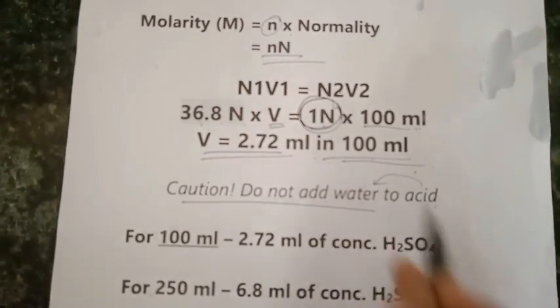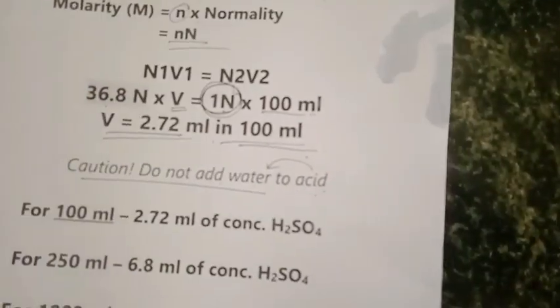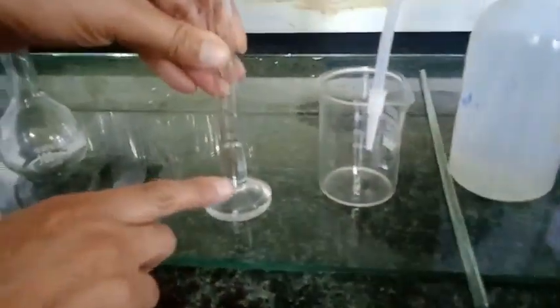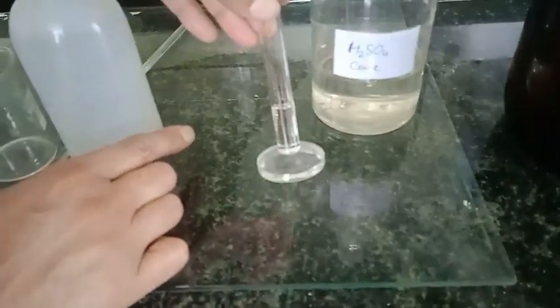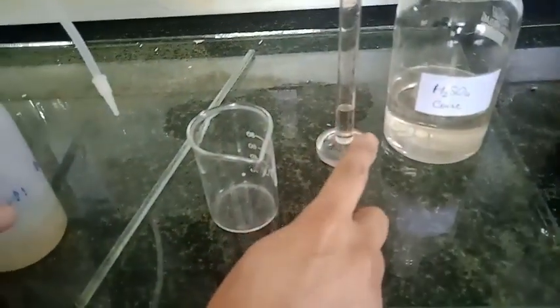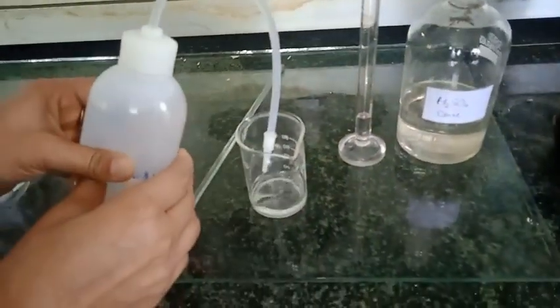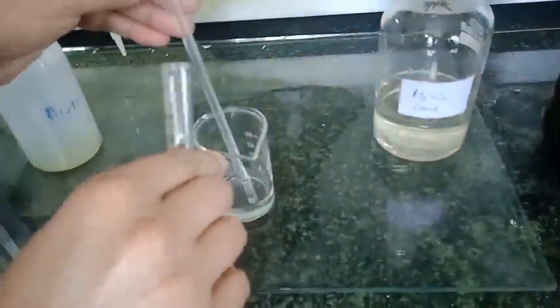Here the calculated amount, 2.7 ml, I have transferred to this measuring cylinder. In this beaker I have taken some amount of distilled water, and with the help of this glass rod I am just going to add this concentrated H2SO4.